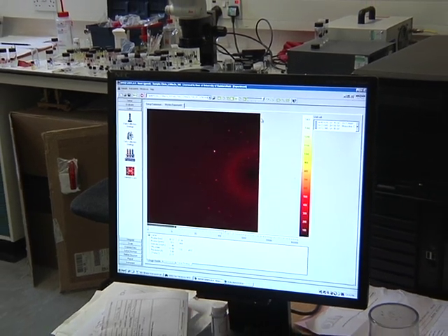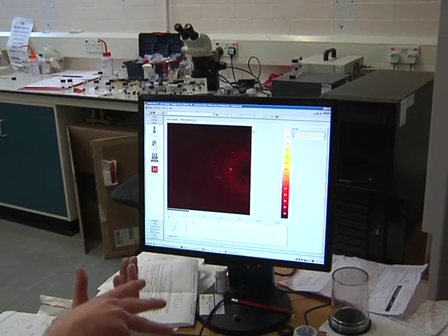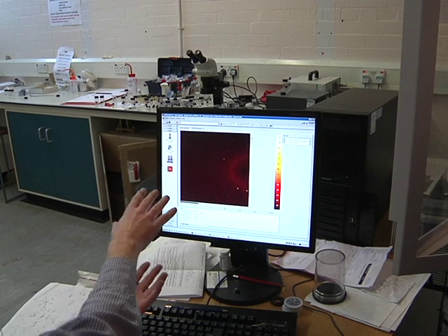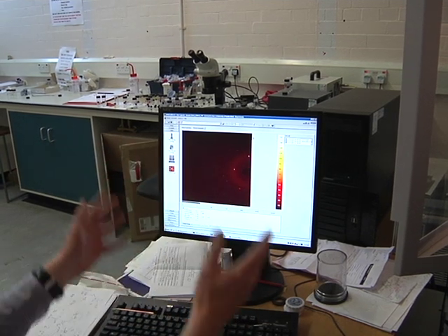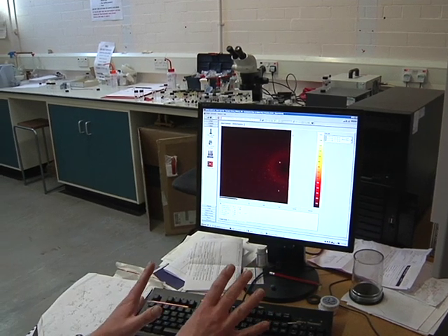So, each snapshot, what we're doing: we're taking the crystal, we fire an x-ray beam, we measure the pattern. We twist the crystal a little, we fire the x-ray beam again, and we measure the pattern. And we keep doing that again and again. In this set of data, we do that a thousand times.